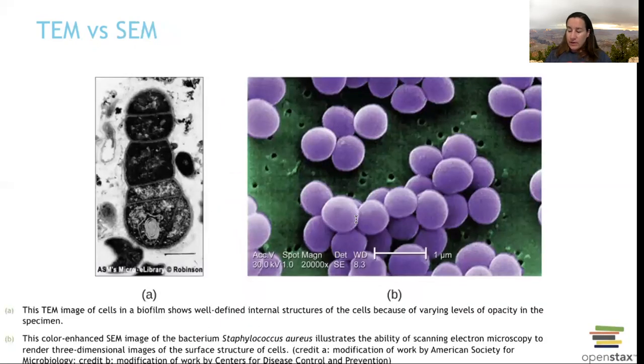And the imagery, right? Our scannings versus our transmissions. Look at all these internal parts that you're seeing here. Look at all these little guys, these structures inside. That's going to be a TEM image if we can see what's going on inside, because it transmitted through.